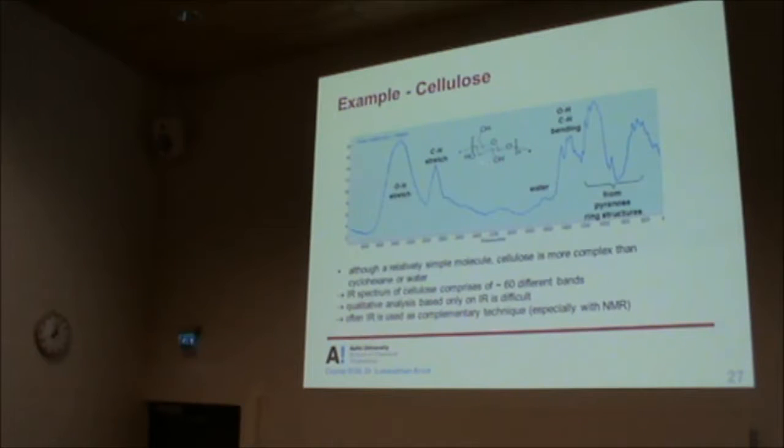So now, one thing is you have a lot of hydroxyls, so you will find an OH stretch, OH bend, and you have a C here. If you see there's a CO, you will also find a CO bond. And what else is there? That's pretty much very basic. Now you can look at the spectrum and you'll find there's an OH, CH, and there's CO, and these are the ring structures. And there is also a bit of water.